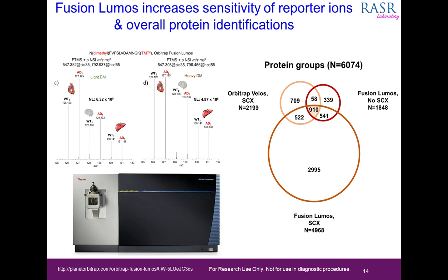So here you can see an example peptide that has been dimethylated on the N-terminus and has been tagged with a TMT6-plex reagent on the lysine residue. And if you just look at C, then what you can appreciate is that within this set of data, we can see the difference in level of this peptide between a wild-type animal compared to a disease animal within a heart tissue, a brain, or a liver tissue. But then if you look across these 12 peaks, then we can actually start to see the differences across biological replicates and within tissues. So we think this experiment is pretty powerful.